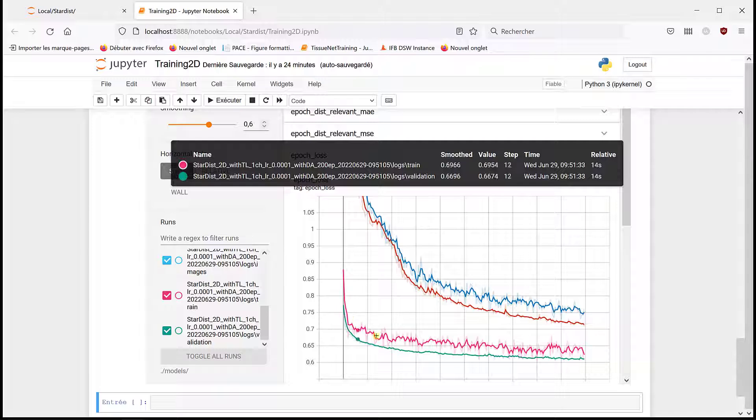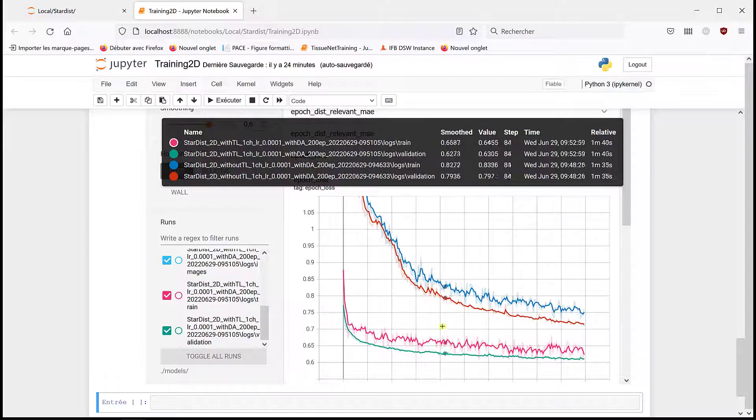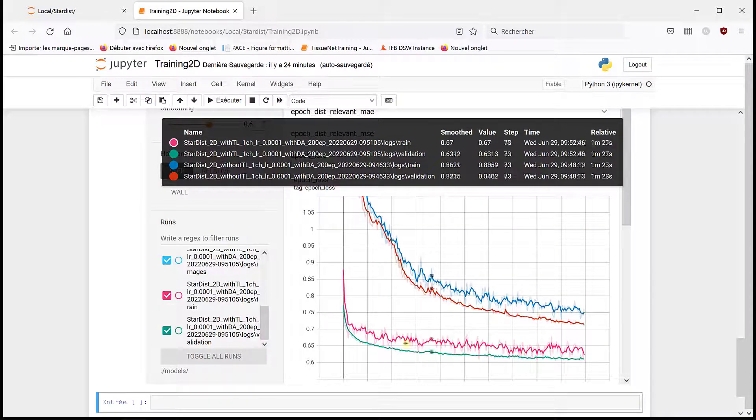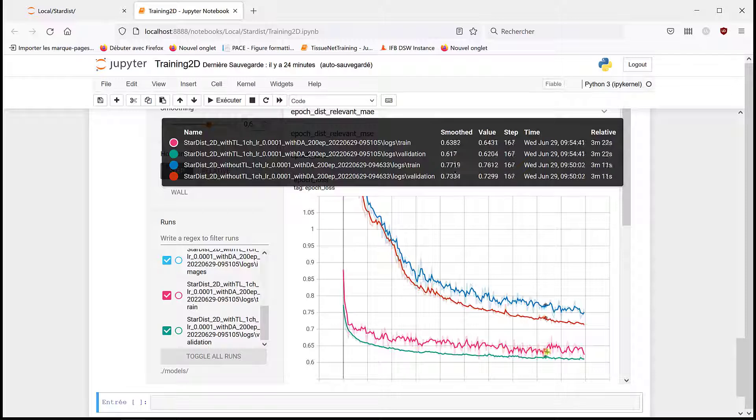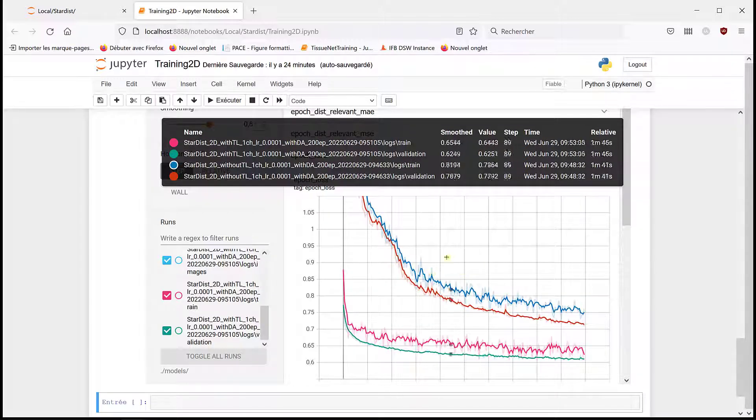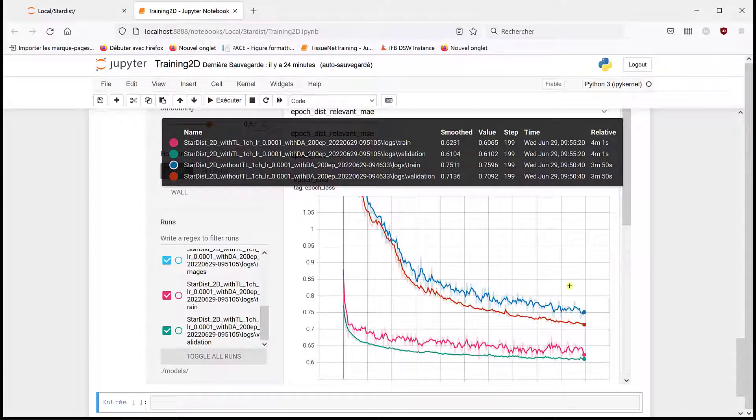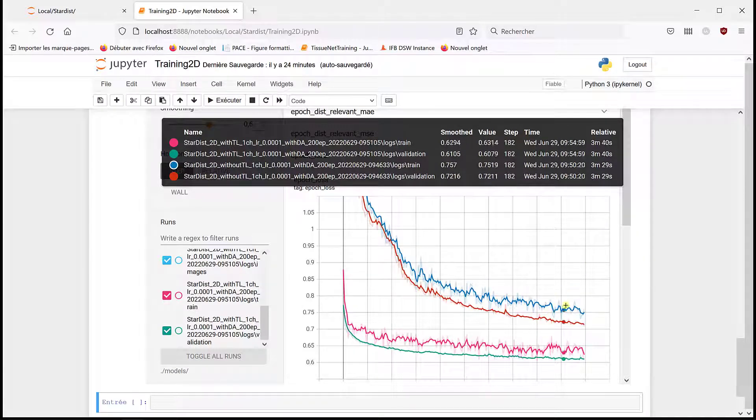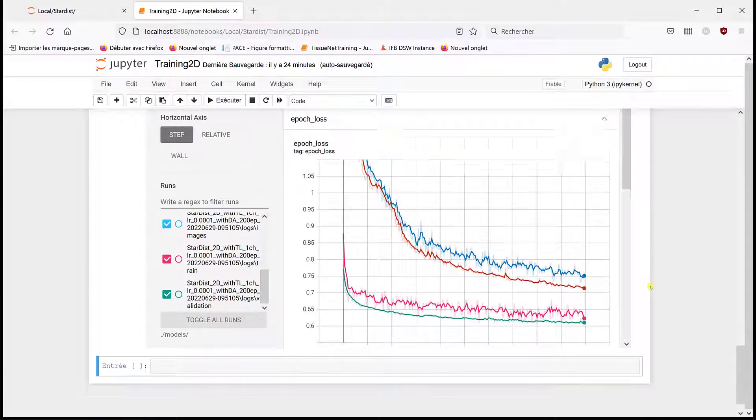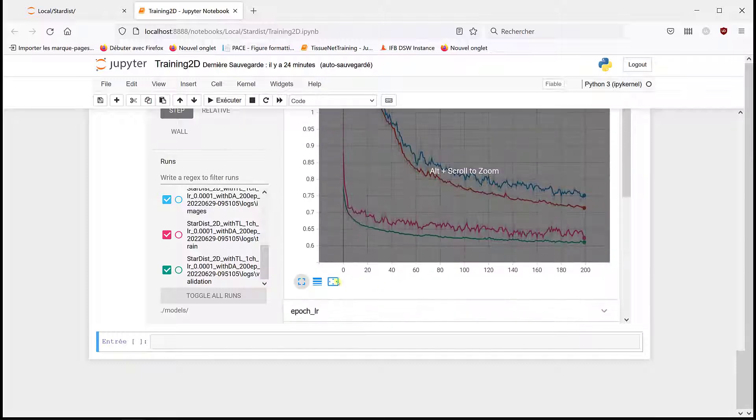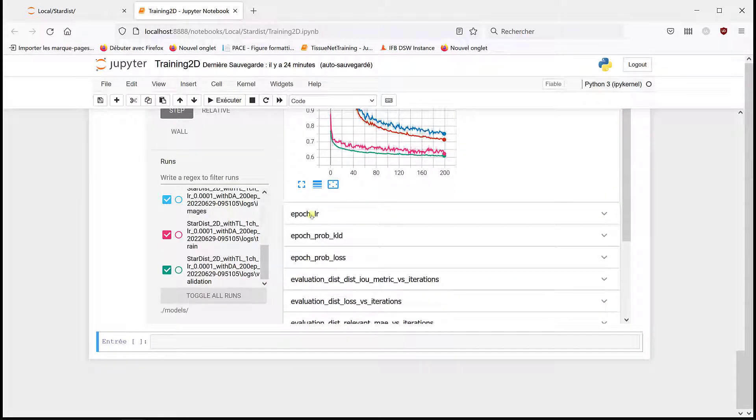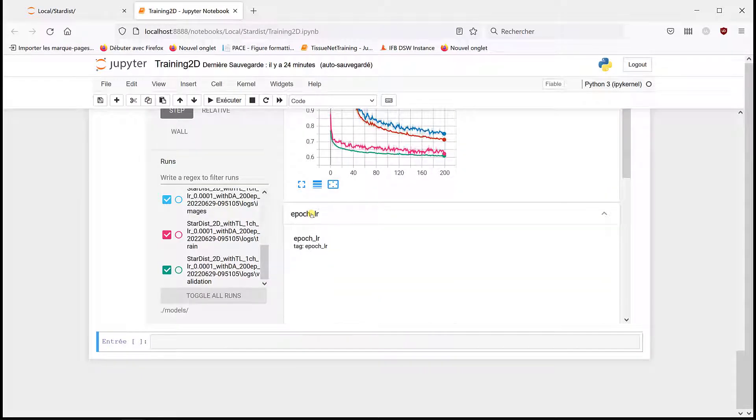Then it seems that we reached some kind of plateau pretty quickly, but it's still decreasing, so maybe we could still improve. It's still decreasing without transfer learning, so probably to have more epochs would help.